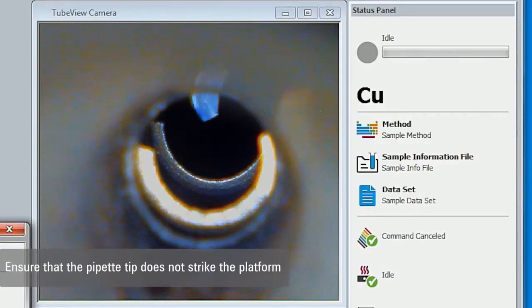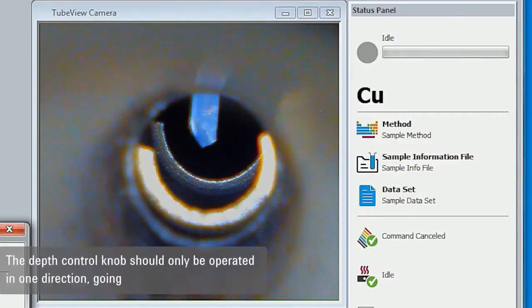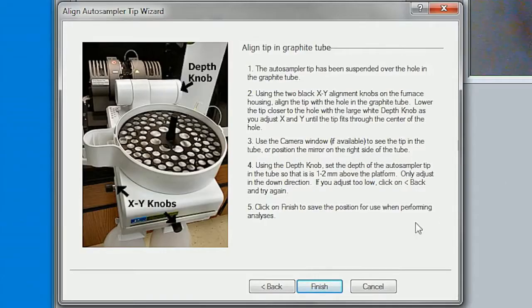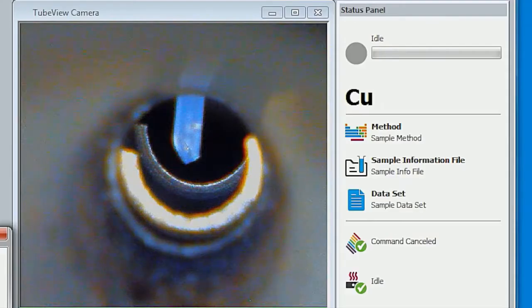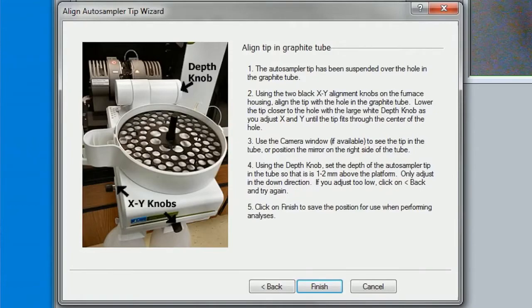Use the tube view window in the software to see the location of the tip inside the graphite tube. Use the depth knob to position the tip one or two millimeters above the platform. If you adjust too low, click back and try again. Click finish to save the position.